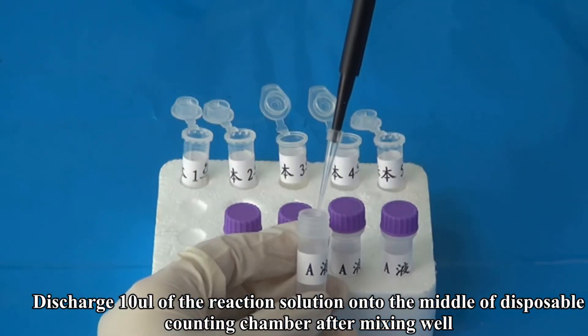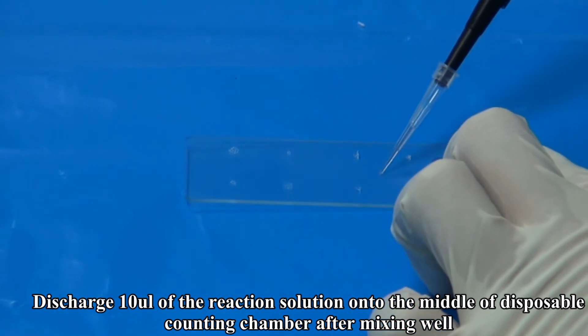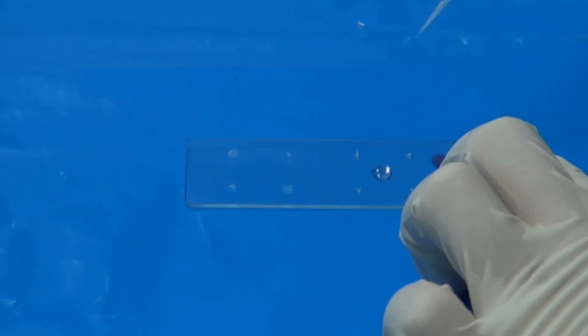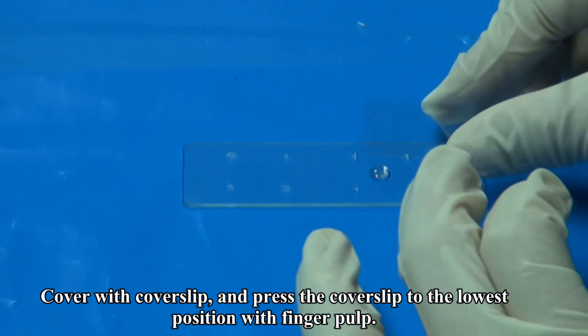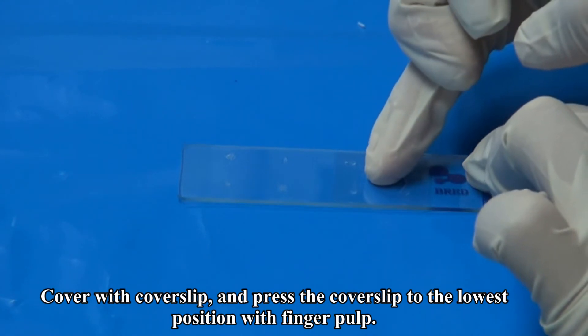After mixing well, discharge 10 microliters of the reaction solution onto the middle of the disposable counting chamber. Cover with a cover slip and press the cover slip to the lowest position with finger pulp.